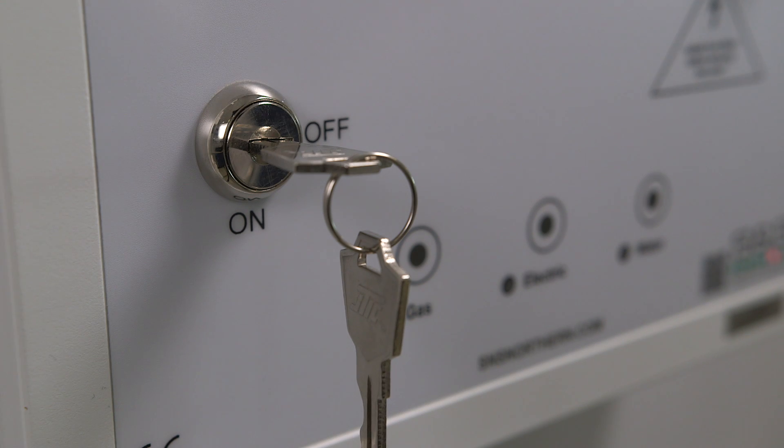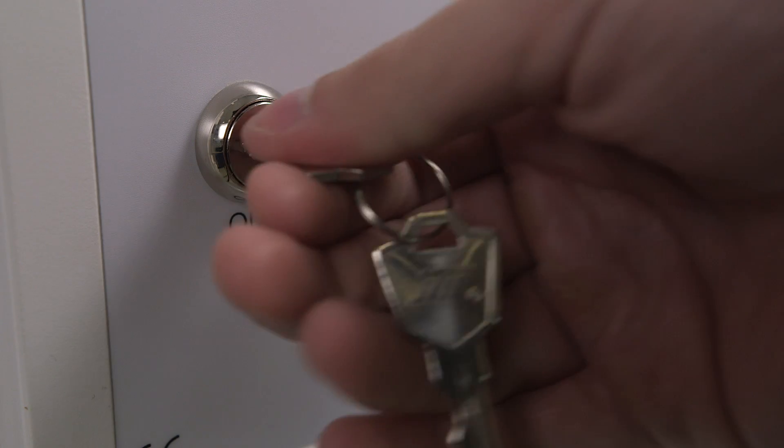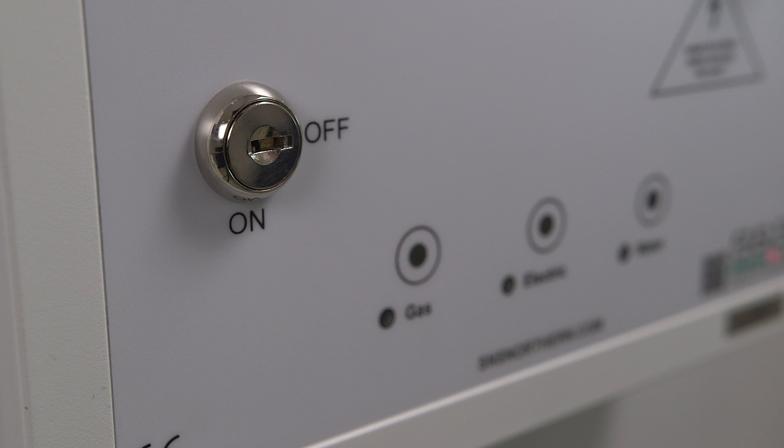The Merlin panel utilizes an electrical contactor to control all the electrical receptacles in the classroom. Once the Merlin panel is turned off, or if the electronics are deselected, there is no power supplied to the receptacles, ensuring a safe working environment for the educator and the students.